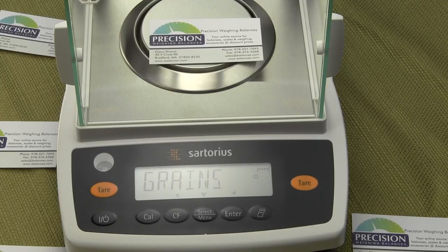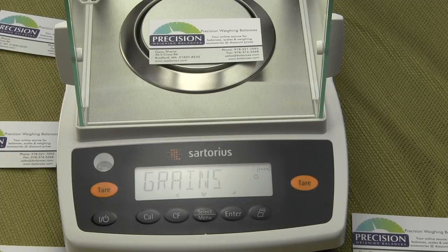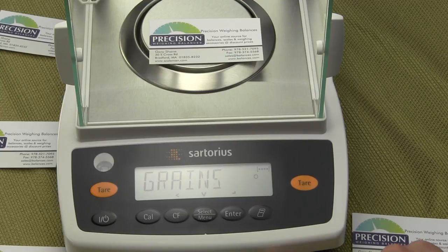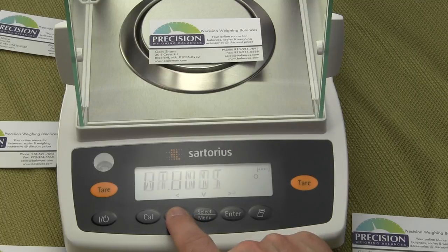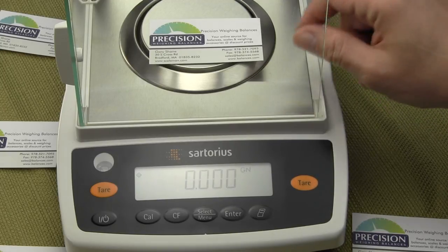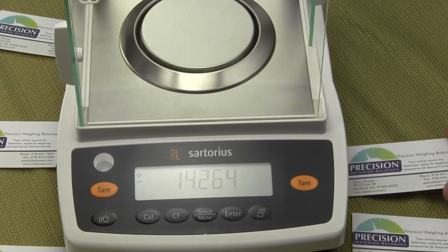If you don't see that circle, it's not going to store the value. Now the primary weigh unit for this balance is set up in grains. We need to get back to the regular startup and exit the configuration mode. To do that, press the clear function key. Since we're in a deep menu tree, press it about four times, and the balance will reset.